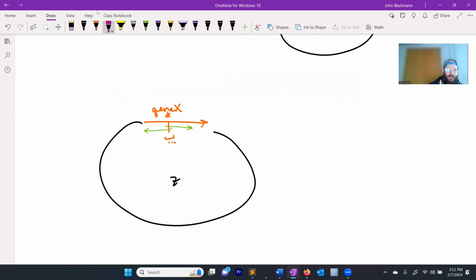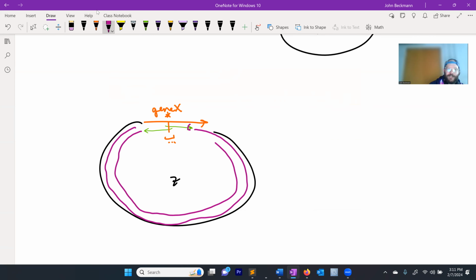And then you run a special PCR reaction, which the polymerase will come on and it will write all the way around the plasmid in both directions, okay? And then after you've done this, you have produced a new product.